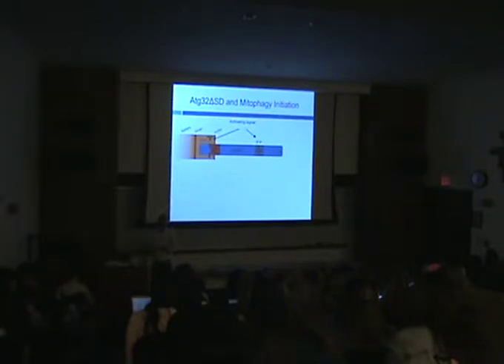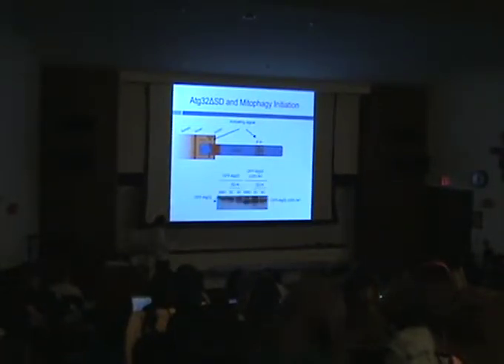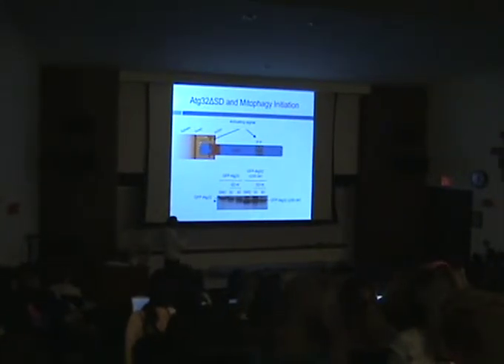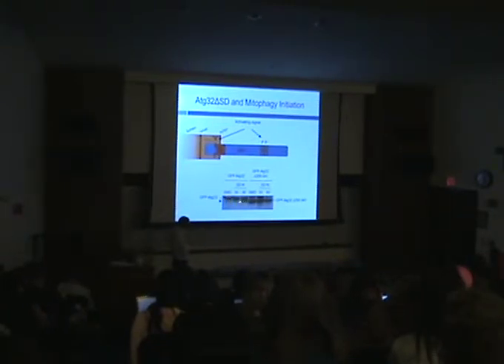So we wanted to know, in the series of this, does our domain function before these or after these? So we can just chop out that domain again and see what happens. As you cleave this part of the protein, you remove it, and now if we look at a Western blot, we see this band gets shifted and becomes a second band here.